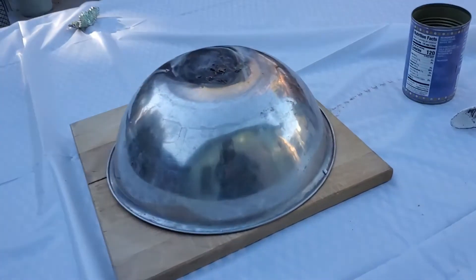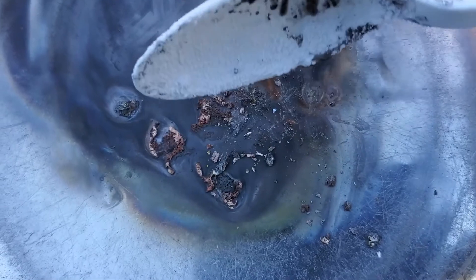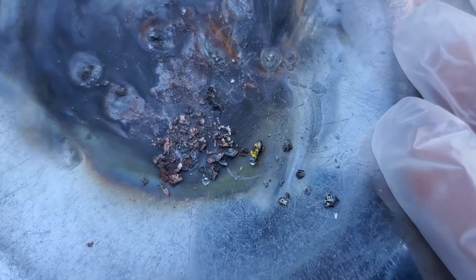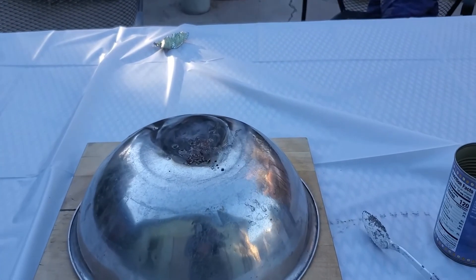I think we have some results. You can see a little bit of yellow in there — I believe that is bismuth trioxide. A tiny little pebble of it. We made a tiny, tiny, tiny amount. It worked! Let's see if we can scale this up.